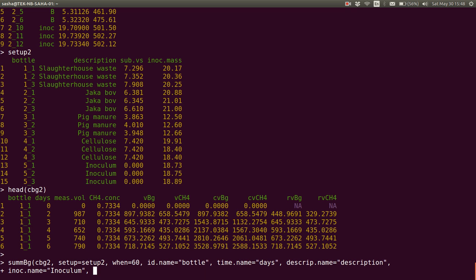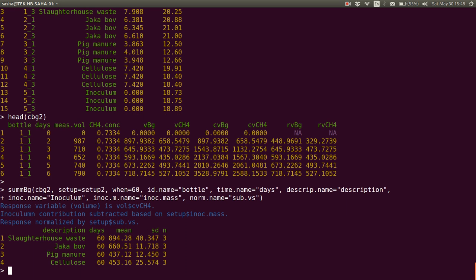And we need inoc.m.name. That's inoc.mass, all lowercase. And do we need anything else? Yes, what do we want to normalize by? By sub.vs. That's norm.name. Okay, let's see if that works.